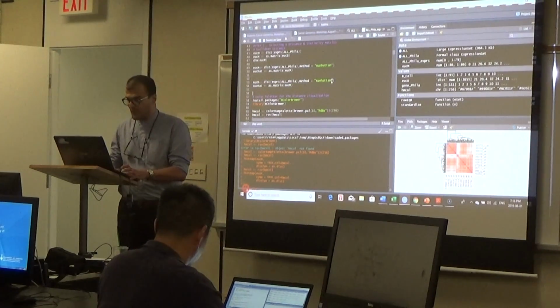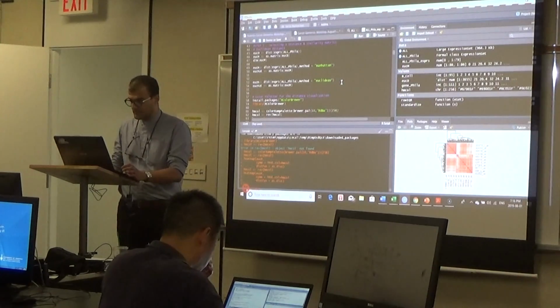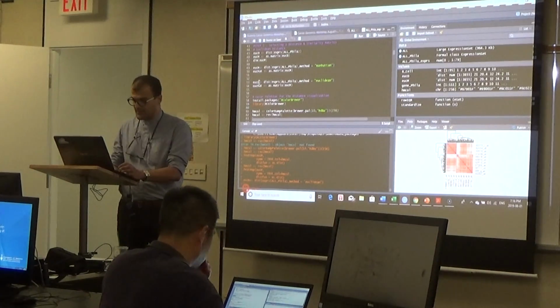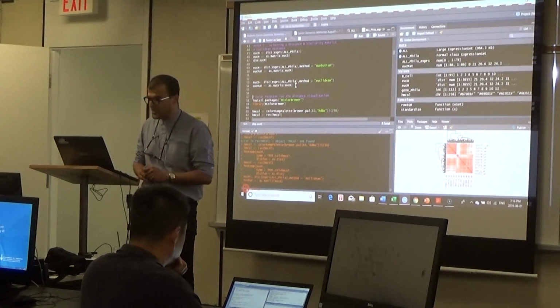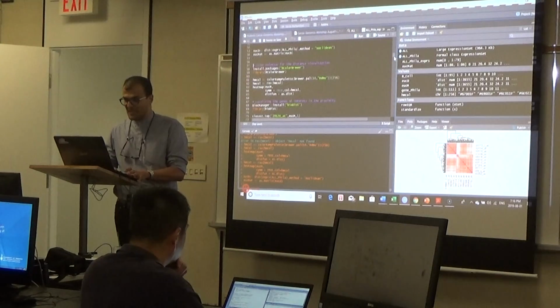For the distance method, I'm just going to write Euclidean. Control Enter. Euclidean distance. Euclidean matrix. D. And as a matrix, I'm just going to run it. And now I'm going to do exactly the same heat map for it.